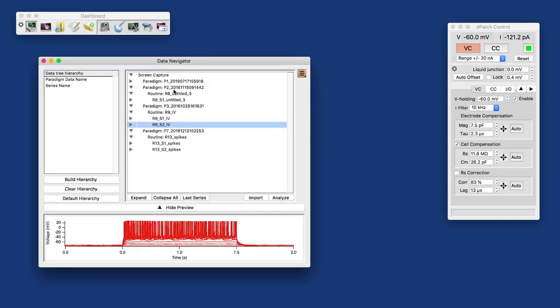This is what I wanted to show today. There's a lot that we have not talked about yet. For example, paradigms, the planned paradigms that I talked about in the data structure. We haven't talked in too much detail about metadata and how to work with them.